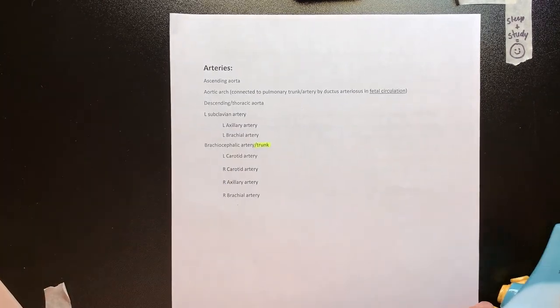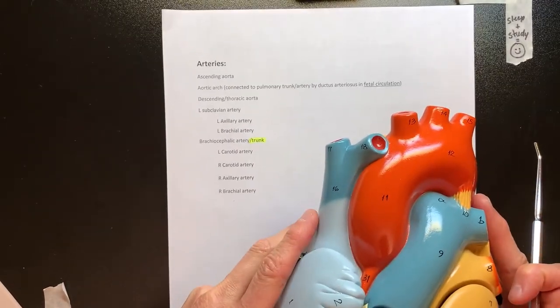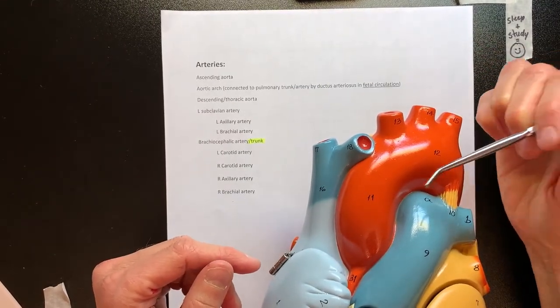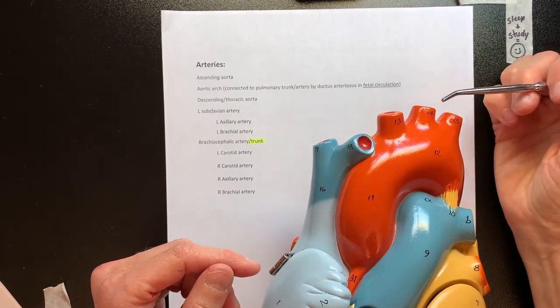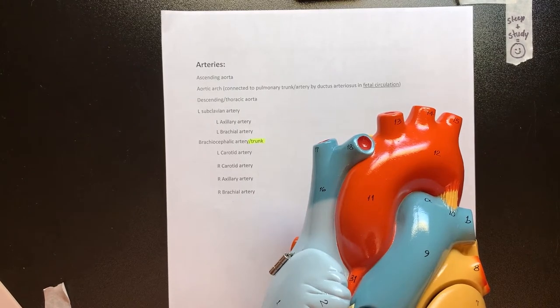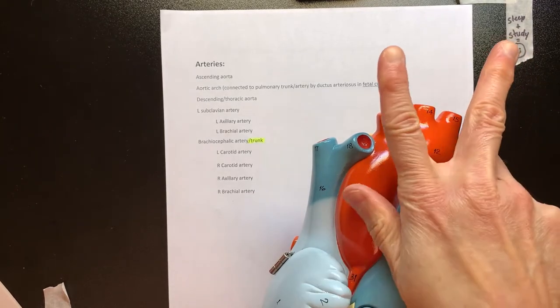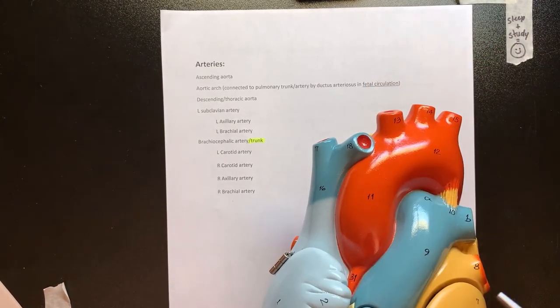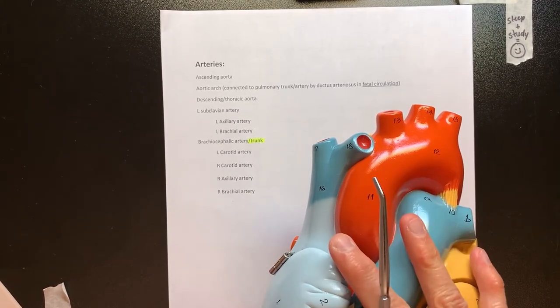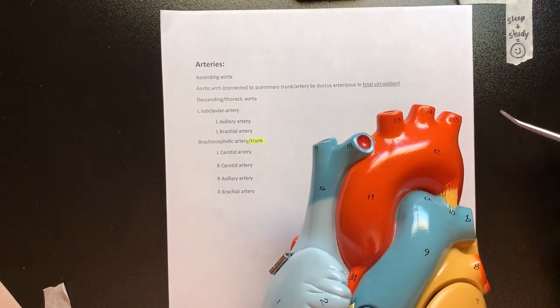Let's look at this model of the human with those words. Because we're taking a human anatomy class, we want to be aware that the human aorta has three pipes coming off the aortic arch — three vessels that exit. The fetal pig only has two coming off the aortic arch. In the human, consider that this person would be facing you, so this side would be the left side.